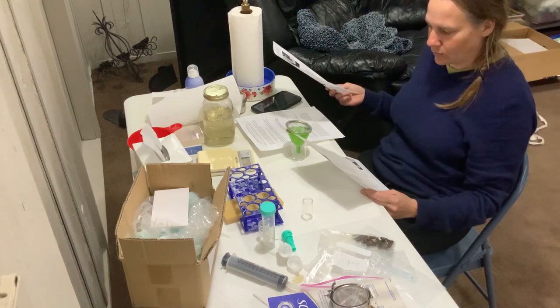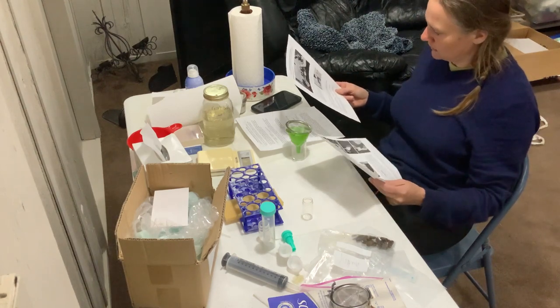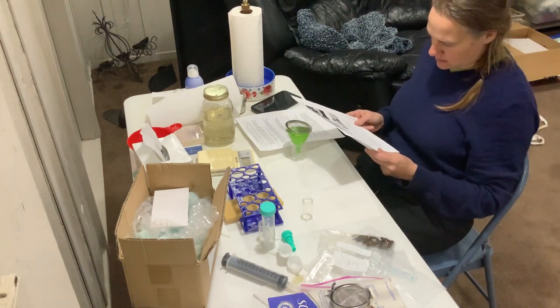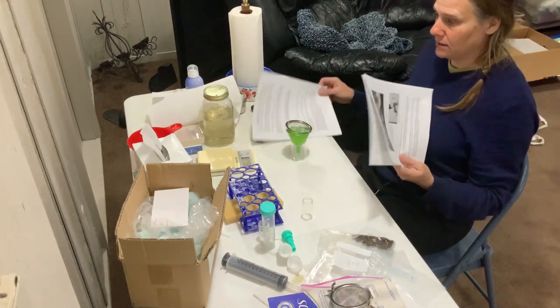It's the eggs per gram count. I just printed it off and now I'm locating what I need to start here. I've got to measure two grams of the fecal pellets.